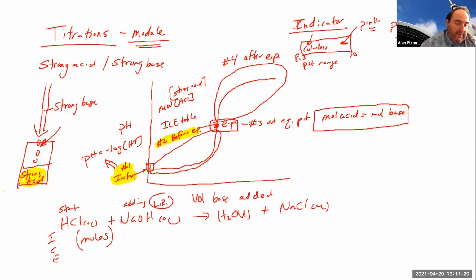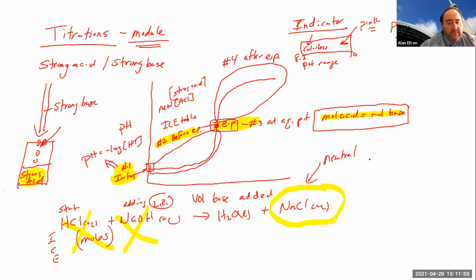That then brings us to the third part in this type of titration. At that third point, the equivalence point, that again is where these two guys equal each other, which means when we reach that point, both of these guys are gone. And really the only thing that we have left at that point is a salt, right? And that salt came from a strong acid and strong base. So from our many conversations, we basically know this is going to be a neutral salt, which means we would expect the equivalence point here to have a pH of 7 in this type of titration.